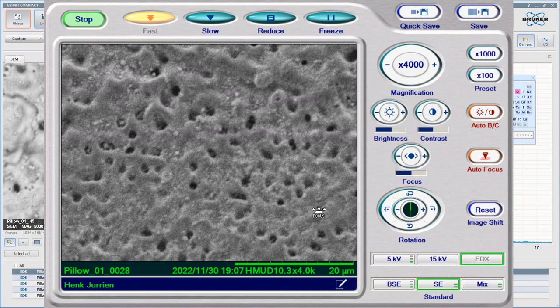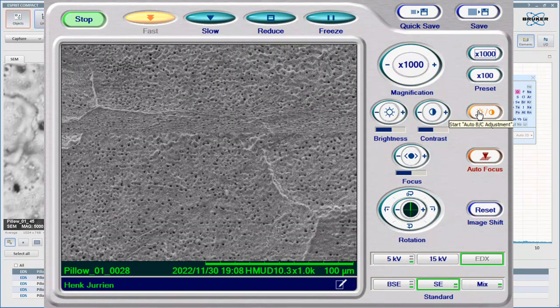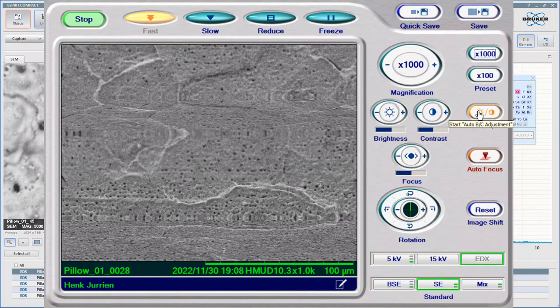I don't see a lot of outies. These seem to be fairly exclusively innies, unless it's not so obvious where the outies are. And, you know, that may be the case. And so what I'm going to do is I'm going to come out of this and I'm going to zoom down a little, and you will see that these become quite extreme.